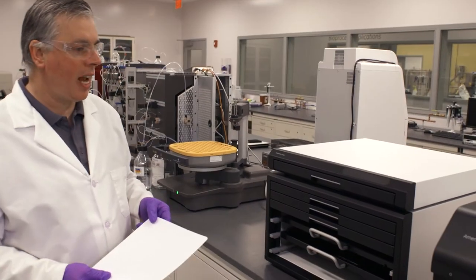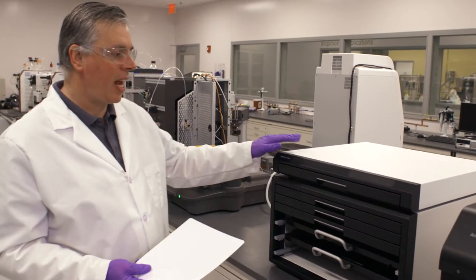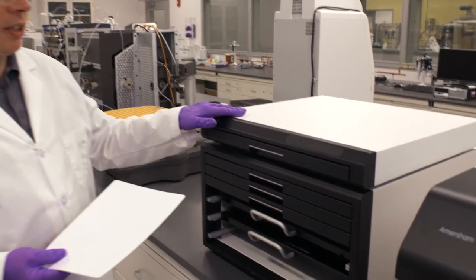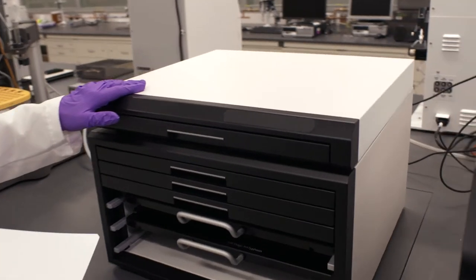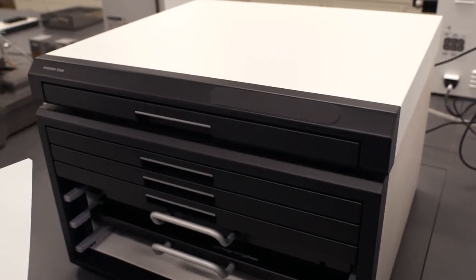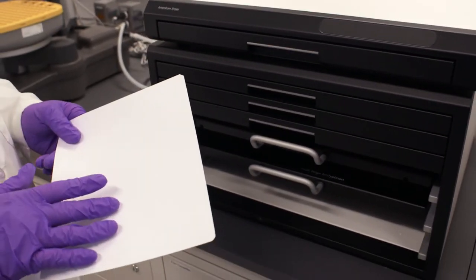In this session we're going to look at the Amersham Typhoon Image Eraser. We need to use this instrument to actually erase our screens before we expose to our radioactive samples.